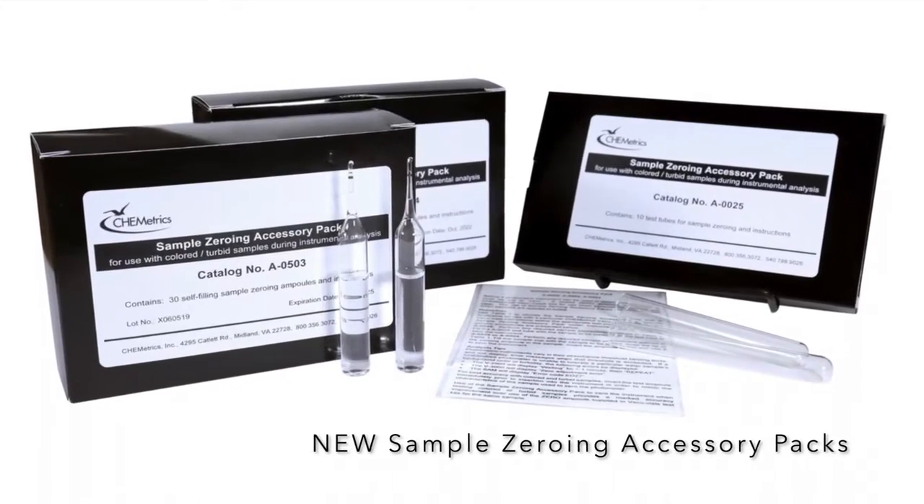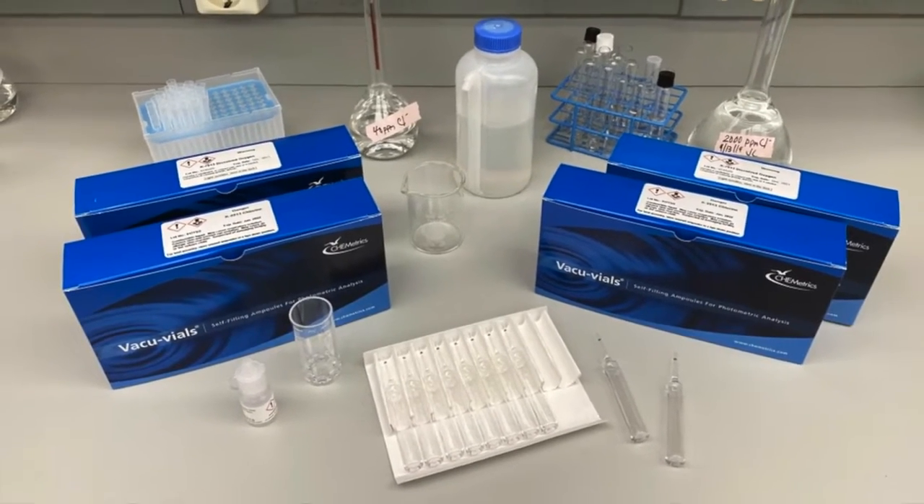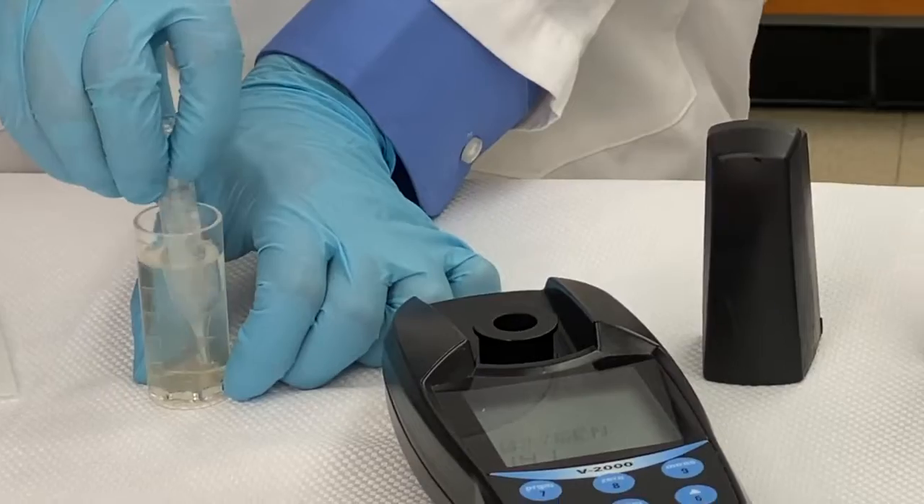Introducing Cometrix's new sample zeroing accessory packs. The VacuVials kit you're using determines the accessory pack you'll need.